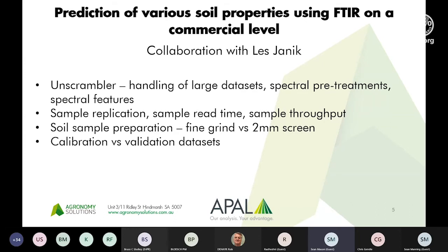Sample read time, again, is about trying to maximize signal quality and spectral quality with read time to push samples through. And I alluded to the issues we had with sample throughput. Soil sample preparation on a commercial level, again, Chris has touched on fine grind. It's probably an issue we're dealing with at the moment. Margins and turnaround times are important for a commercial lab, so if we fine grind everything, that really does set us back. There is a trade-off in sample preparation. Pouring the sample into cups, if it's fine ground, and leveling it off is actually a lot easier than with a 2 mil screen. That's soil type dependent. So that's just the battles we've had to do.